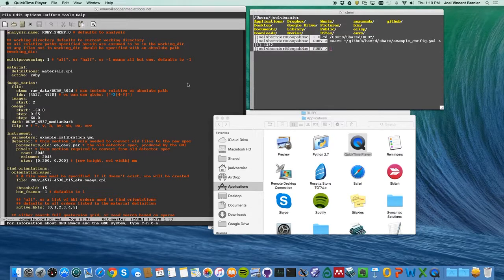Okay, in this first video I'm going to show you how to calibrate a detector from a powder pattern using HexRD's old graphical interface. If you don't have a powder pattern, then we can skip ahead to the next step, but if you do, then this is the procedure.